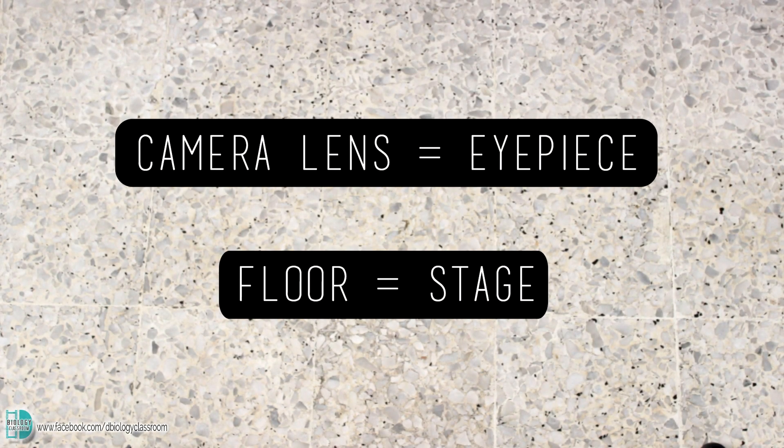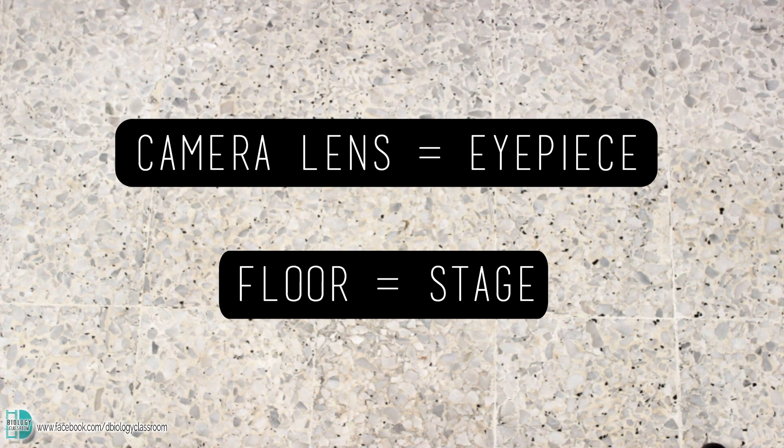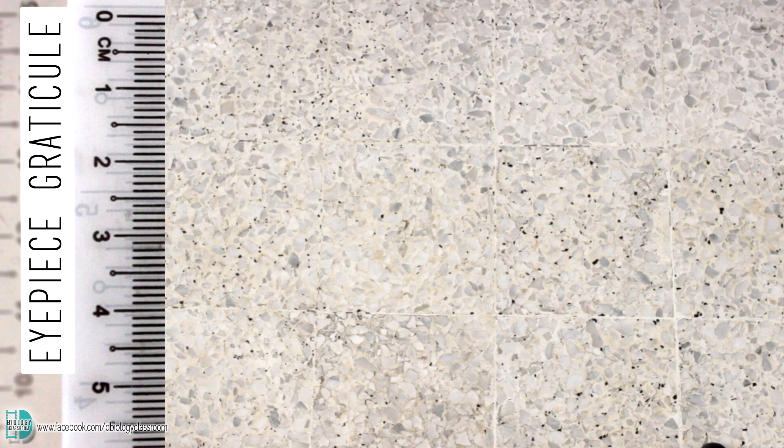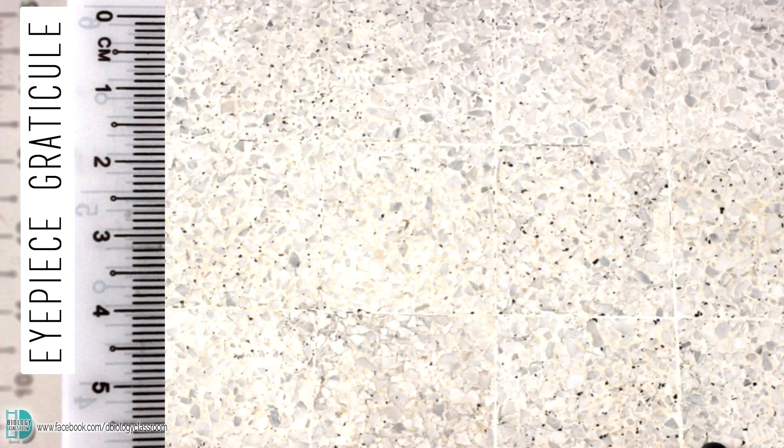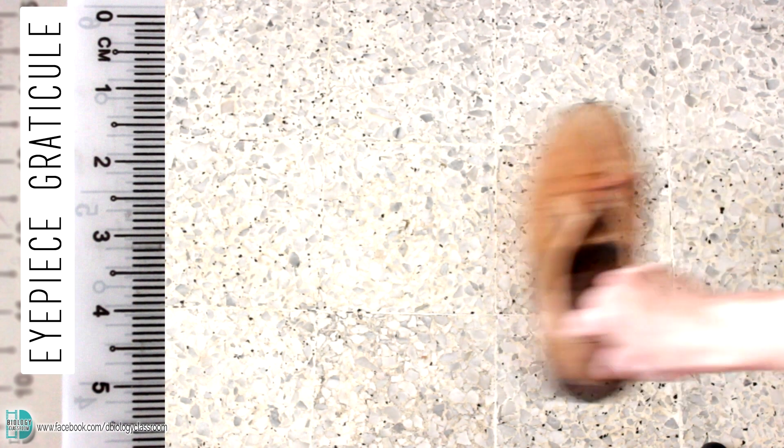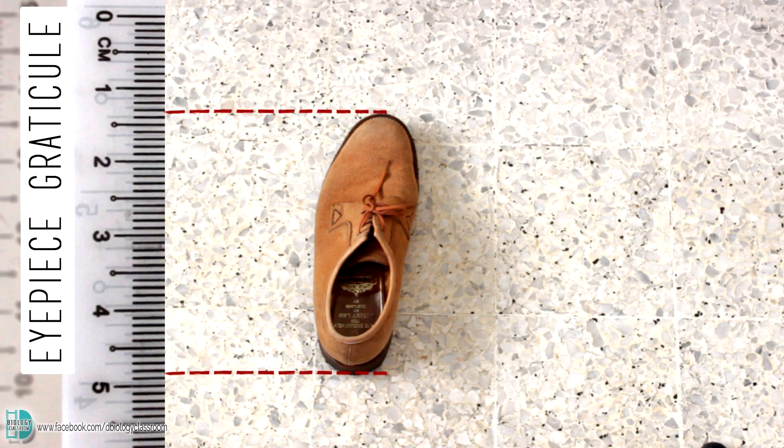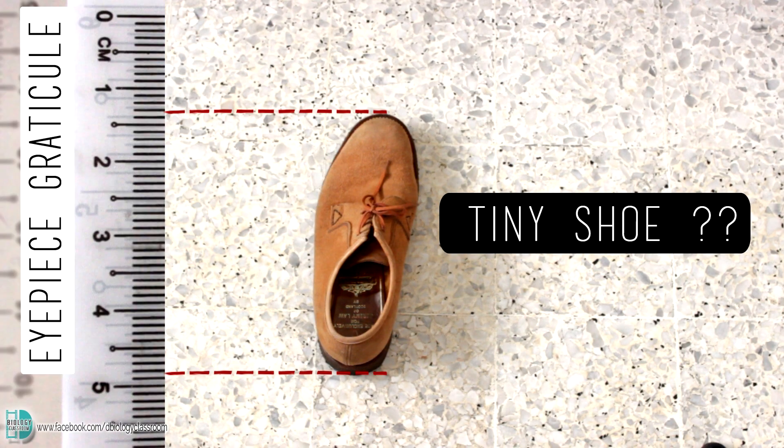Imagine my camera lens is the eyepiece of a microscope. The floor is the stage. If I fit a ruler at the lens, can I use it to measure what I place on the stage? Now, let me put one of my shoes on the stage. The ruler is showing me that my shoe is less than 5cm. Does that make sense to you? Is my shoe really that small? Of course not.